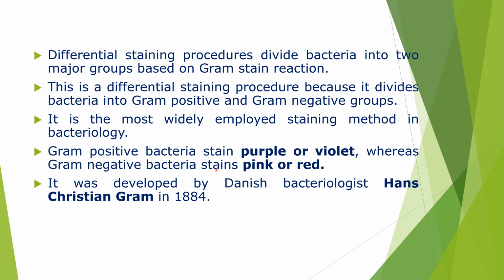Gram positive bacteria will stain purple or violet in color, whereas gram negative bacteria stain pink or red in color. The scientist who developed this gram staining technique is Hans Christian Gram in 1884, and he was Danish and a bacteriologist.